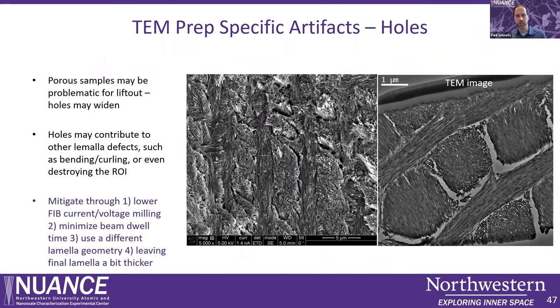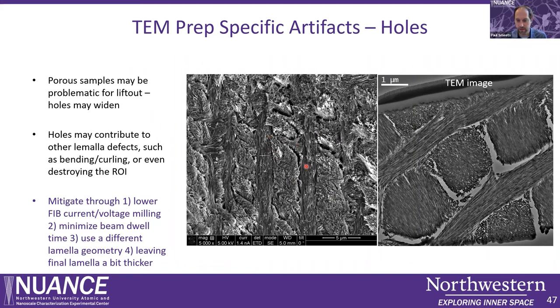The last artifact is holes in your TEM lamella. With porous samples, pores can become wider during TEM thinning, leading to other artifacts such as bending, curling, or completely destroying the region of interest. For example, in a mouse enamel sample with crystallites oriented in bundles, there is a huge amount of porosity. I left the sample slightly thicker than 100 nanometers because going thinner would cause it to completely disintegrate. Sometimes leaving a sample a little bit thicker can actually be advantageous.